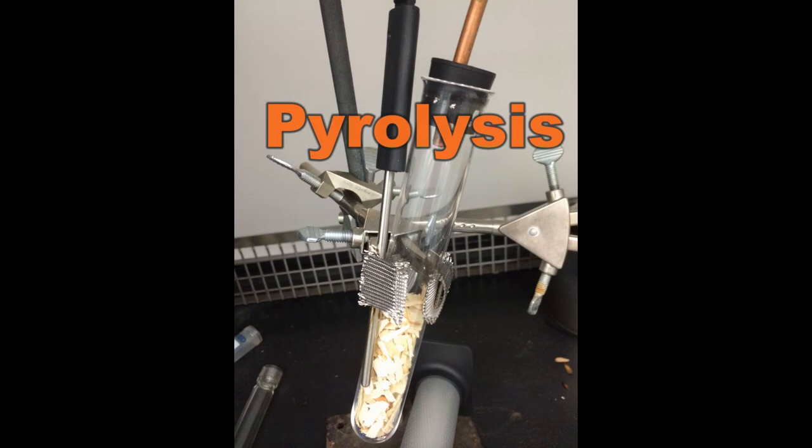Good morning. Welcome to the pyrolysis tutorial. This video tutorial will outline materials required and procedure to be followed when performing pyrolysis.